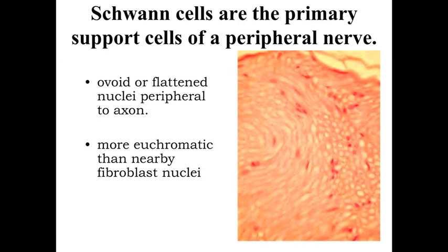Within the peripheral nervous system, we're going to have support cells similar to the glial cells within the central nervous system. These support cells in the peripheral nervous system are referred to as Schwann cells. These Schwann cells are going to be, in many cases, difficult to identify, except for the fact that we're going to see them associated with this wavy pattern of peripheral nerves and the axons that they're supporting. If we look at what we can see of these cells, they're going to have ovoid or flattened nuclei, which are peripheral to the axon, and by definition we're going to use this as an identifying characteristic of the Schwann cells.